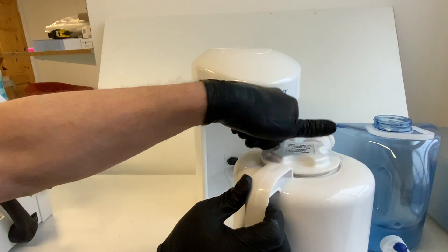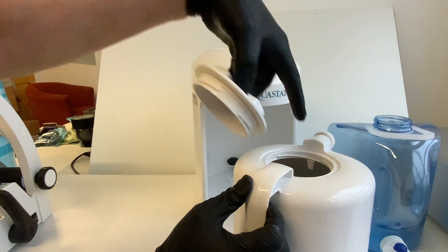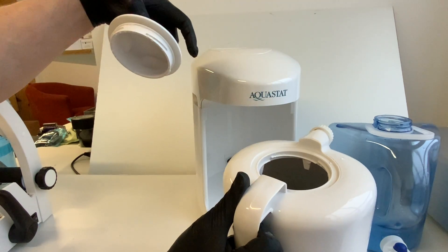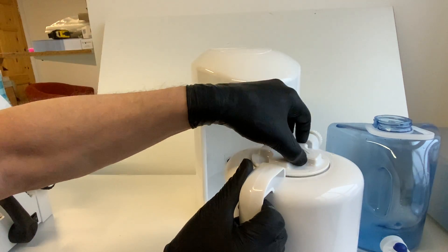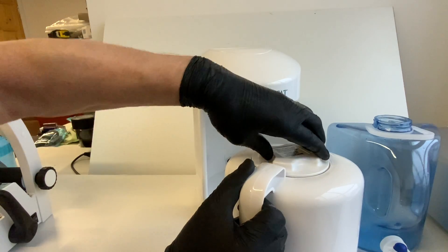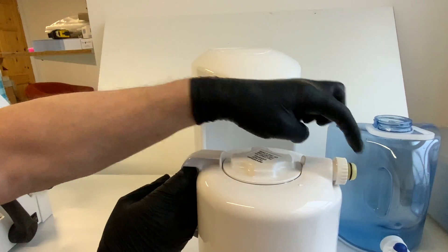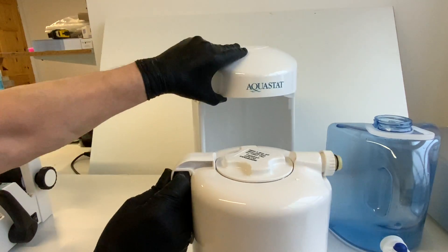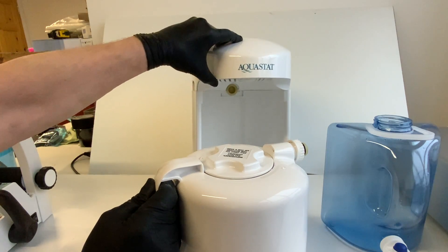This jug has a cap and you can fill the water in there up to the marker. Make sure you seal the lid tightly, and this piece here will fit into the back of the Aquastat.